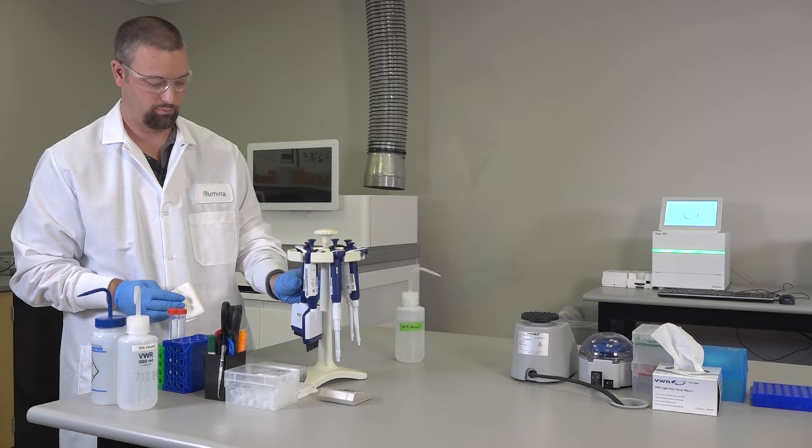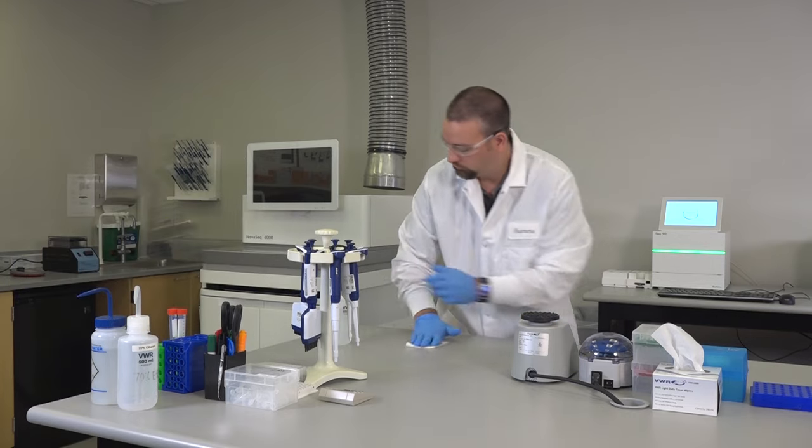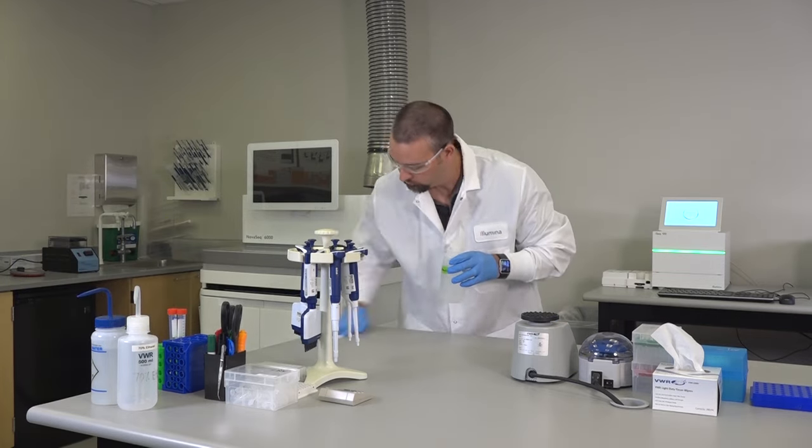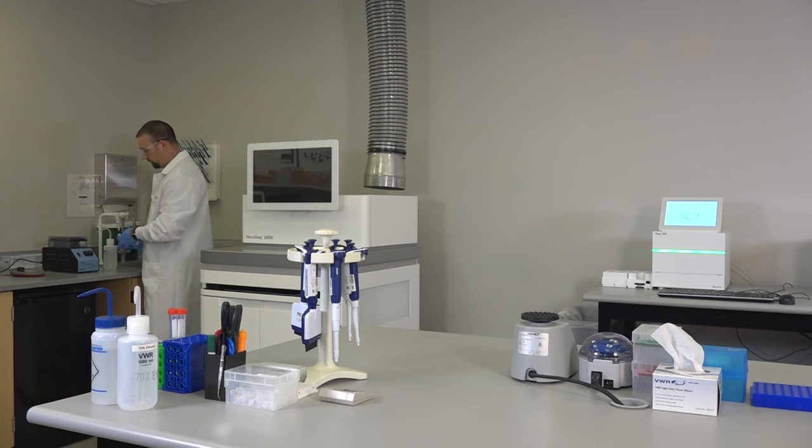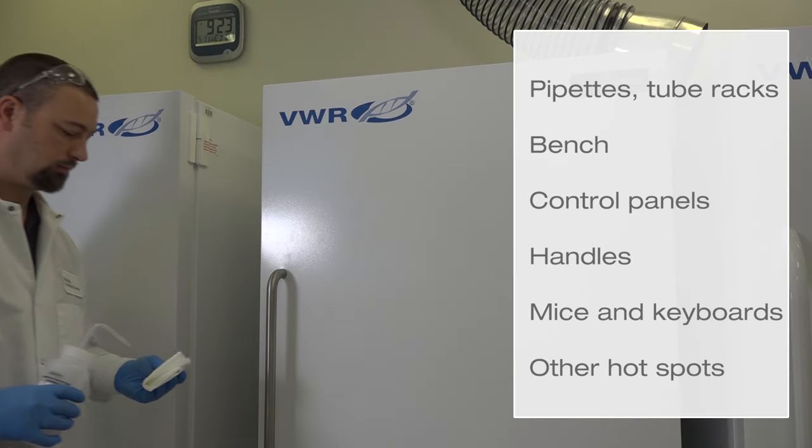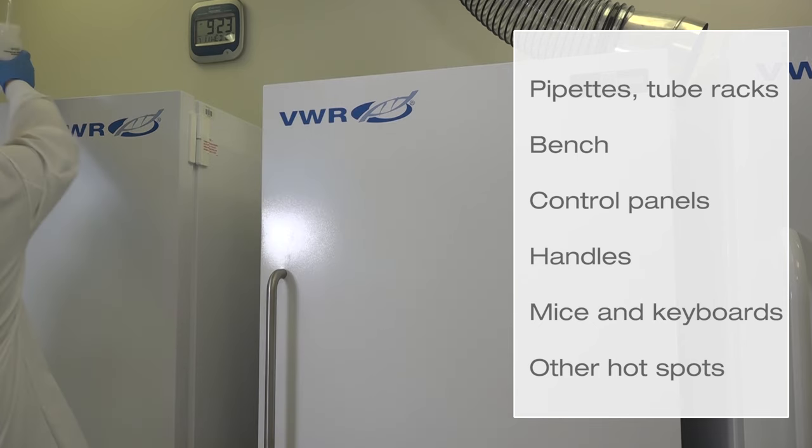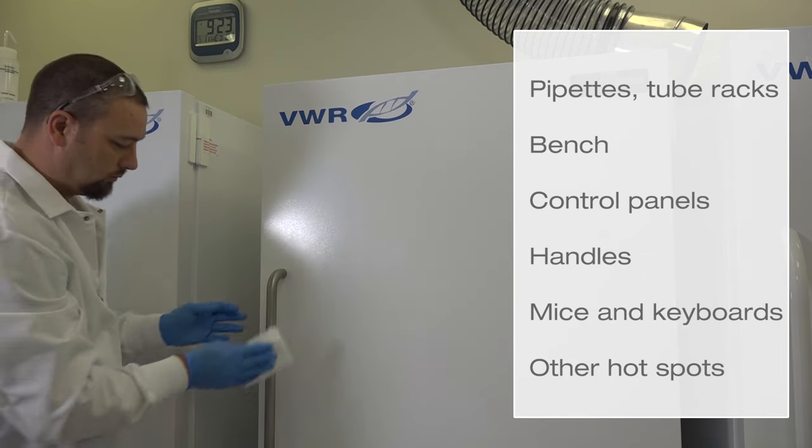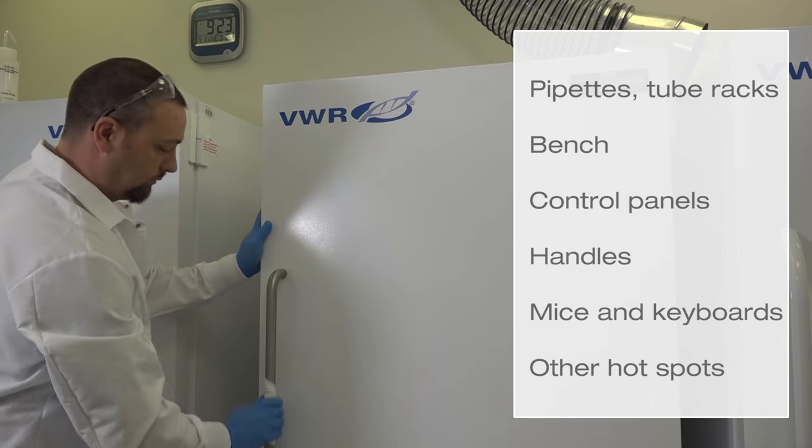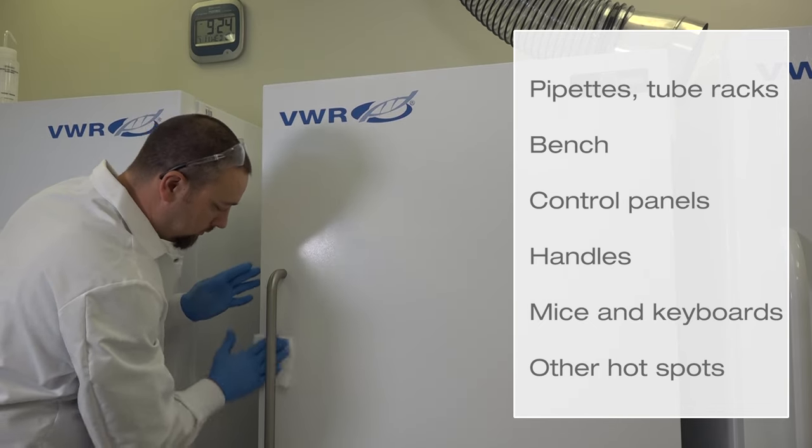Areas to target include pipetters, tube racks, bench tops and other utilized surfaces, control panels for heat blocks, centrifuges, or vortexers, handles for freezers, refrigerators, ovens, or often used drawers or cabinets, computer mice and keyboards, any area that is commonly touched during normal lab operations, often referred to as hotspots.